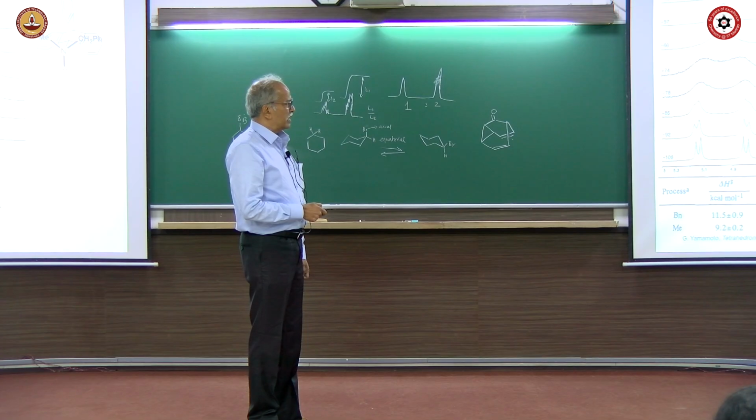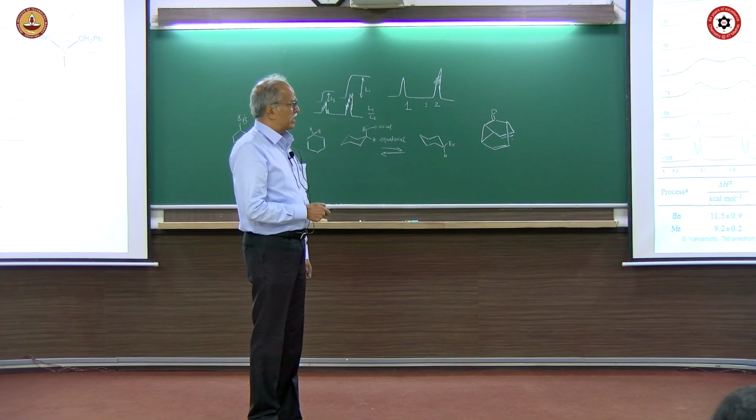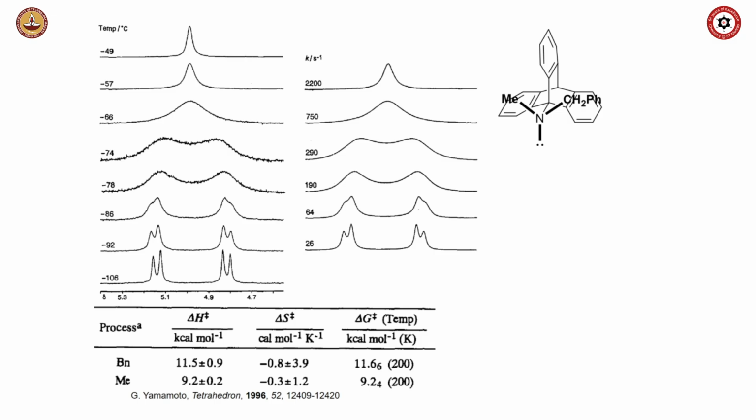This is a chiral center and this is an adjacent prochiral center. With prochiral centers, usually a diastereotopic relationship will be there. The two hydrogens will come separately in the NMR spectrum. So indeed the two hydrogens come separately in the NMR spectrum. Each has a doublet. An AB pattern is what is seen here.